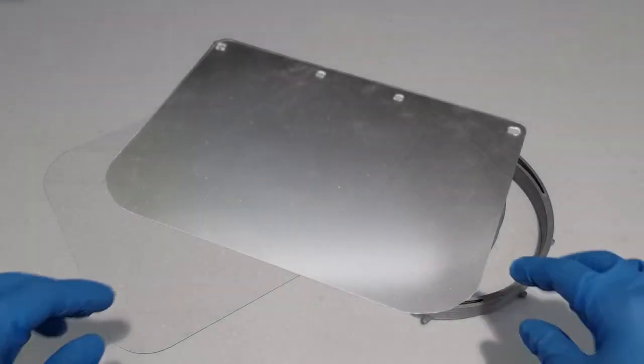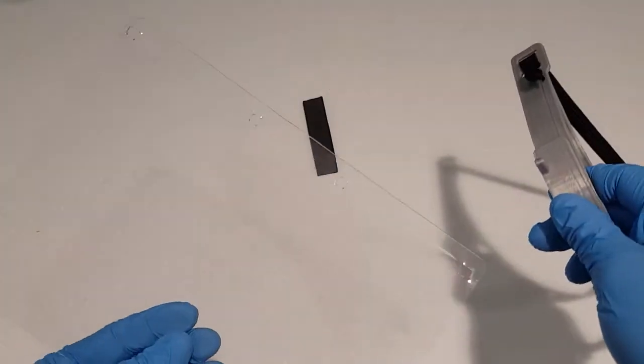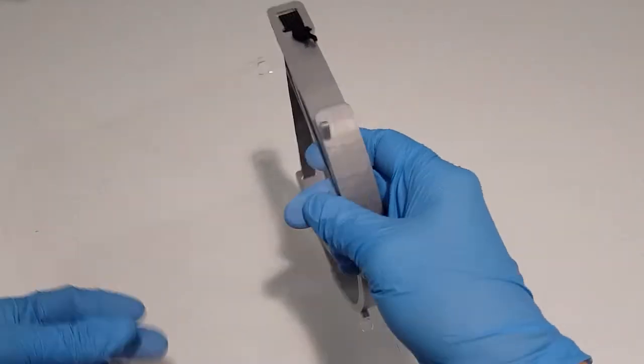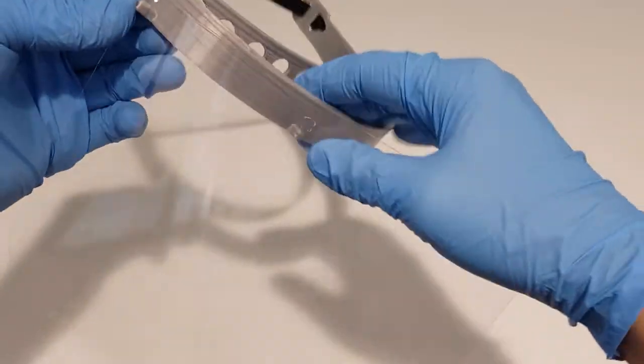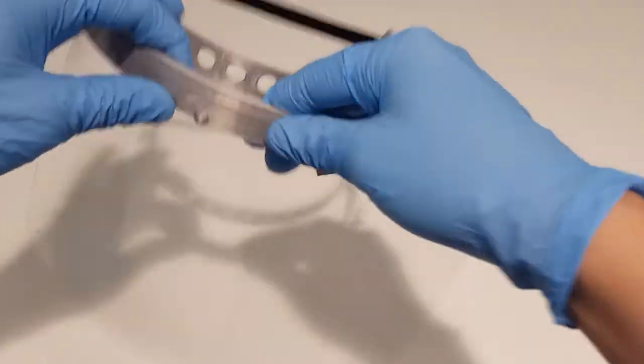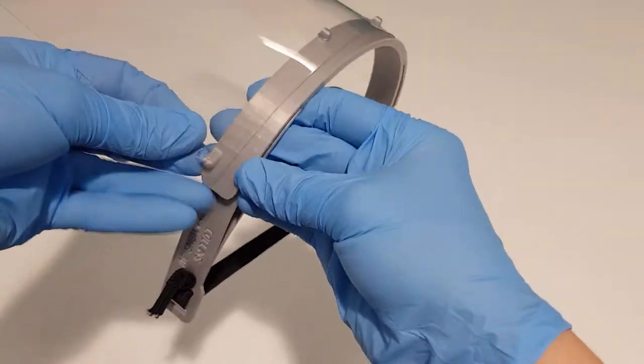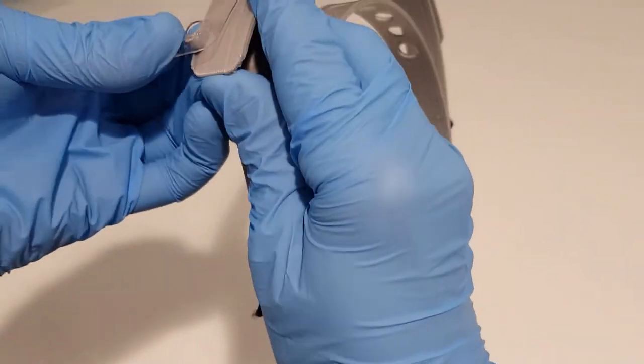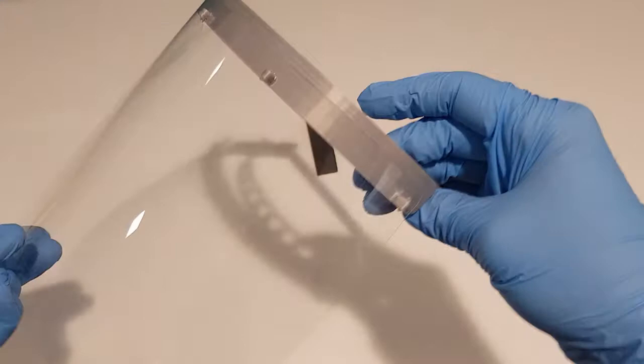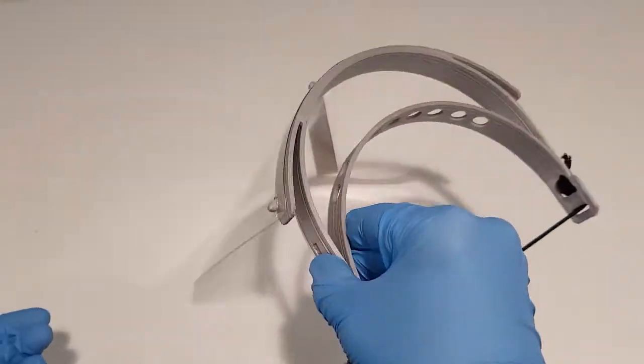Mount the PETG face shield on the headband using the second hole from the right. Hold it with your thumb. Carefully straighten the right side of the headband along the face shield and insert the pin. As soon as the pin is through you can release the thumb.